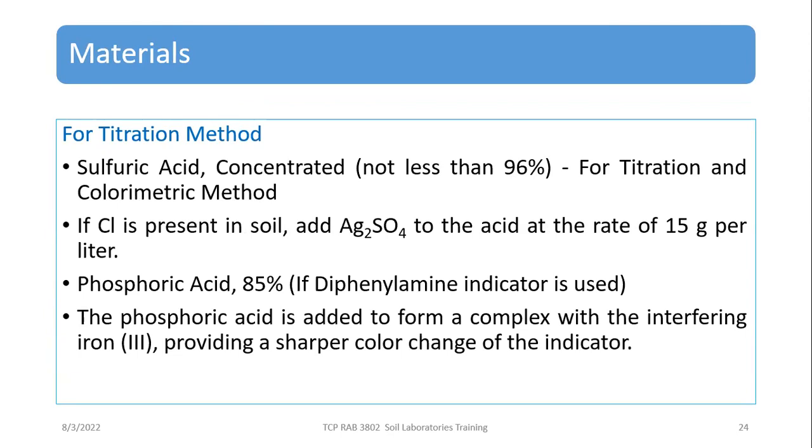Sulfuric acid, concentrated, not less than 96%. And this is for the titration and colorimetric methods.